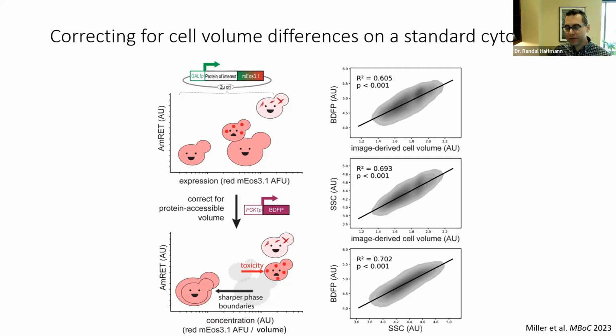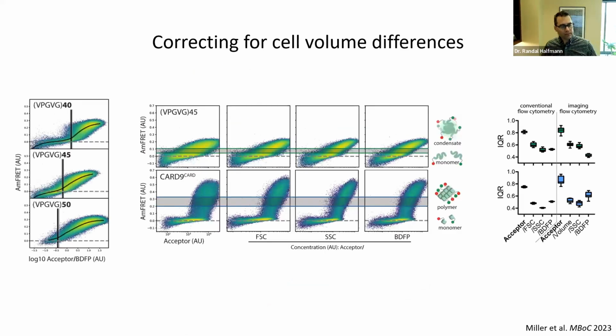Importantly, it also allows you to do this without an imaging cytometer, right? Most labs have access to a standard flow cytometer, not an imaging cytometer. And now you can do this very accurately without imaging cytometry. So that was an important update.